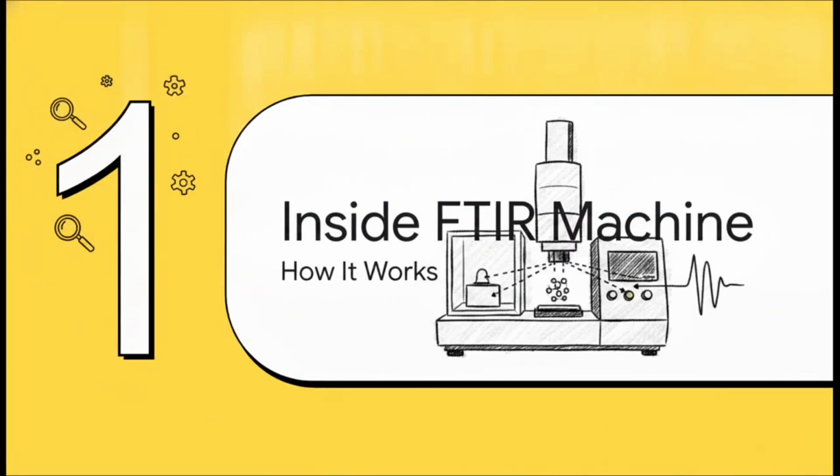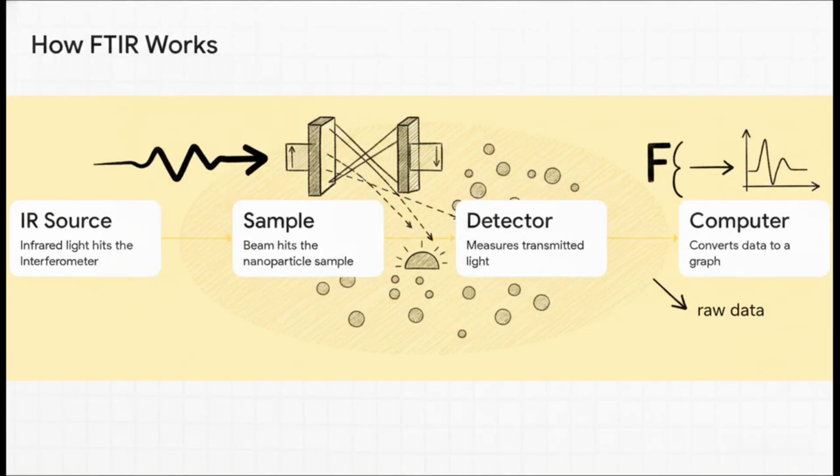Part 1. Inside the FTIR machine. Let's actually trace the journey of a photon through this crazy gadget. It kicks off at the IR source, which fires a beam of infrared light. That light shoots straight into the interferometer. Now, what's super cool here is that this interferometer uses both a fixed mirror and a moving mirror. So that moving mirror actually creates this complex interference pattern with the light before it even gets close to our sample.